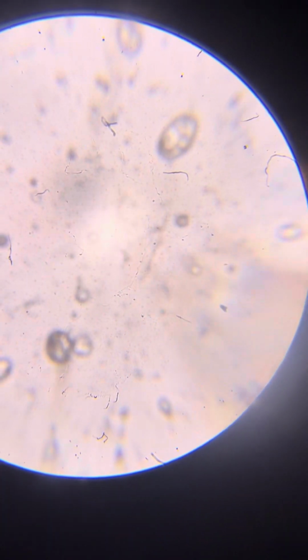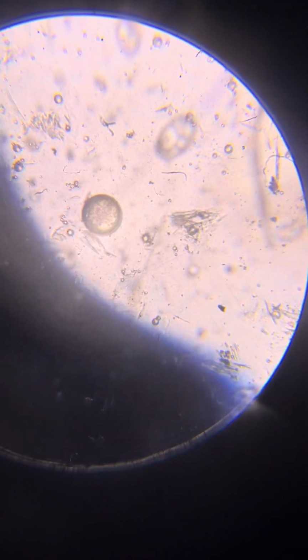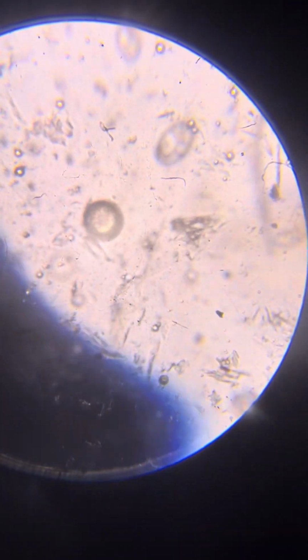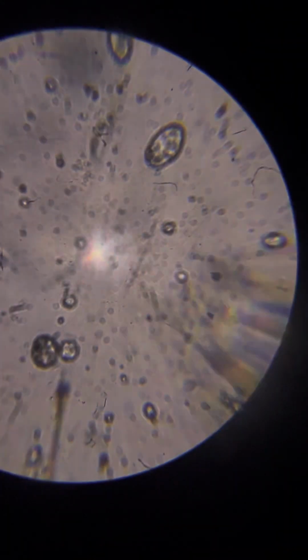This one is interesting. Let's zoom in. Nice. So maybe we do even more zoom in. This is like 600, I think. Difficult to focus with this one, and certainly when I'm both standing in an awkward position and also using the iPhone, which is not, of course, the best way to view, but that's what I can do right now.